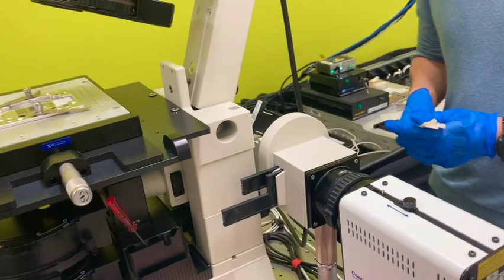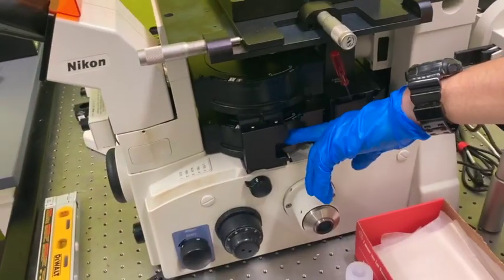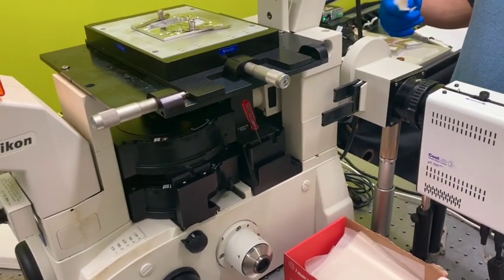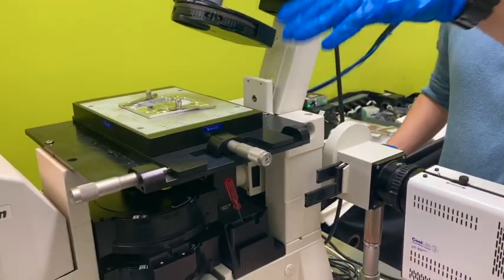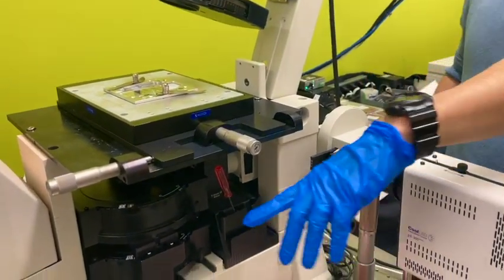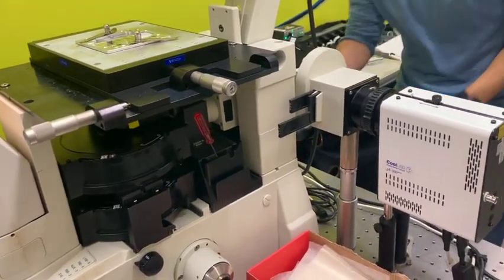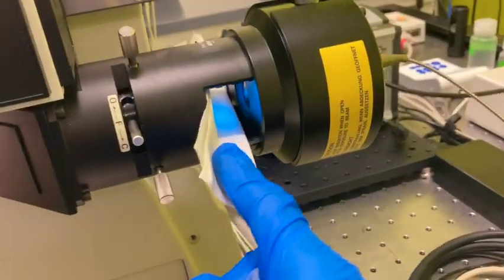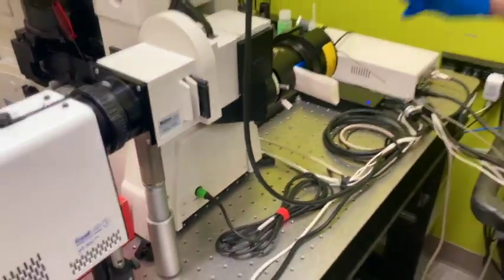Because the laser goes through different filters inside this turret, sometimes you turn that on and no laser is coming out. That's okay, because you might have different filter sets here. But a very direct way to see if the laser is working is inside this. You can put a piece of paper in, and then you turn it on, and then it's here.